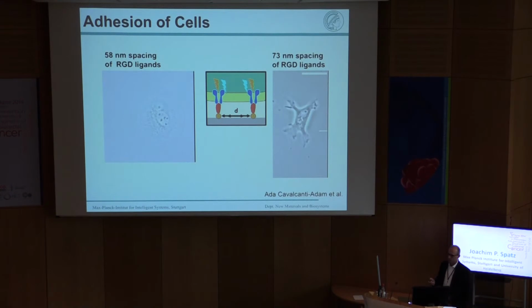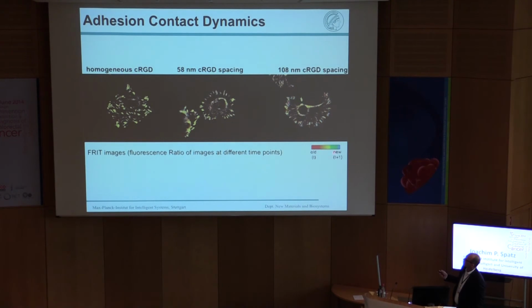So if you then build a substrate which offers specific ligands or antibodies for a certain tumor cell you expect, then you can even enhance the contrast which you expect from measuring the fractal dimension. And by just changing the substrate, you see how you change the phenotype.